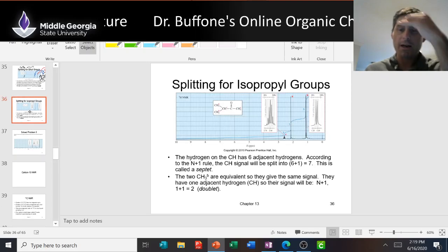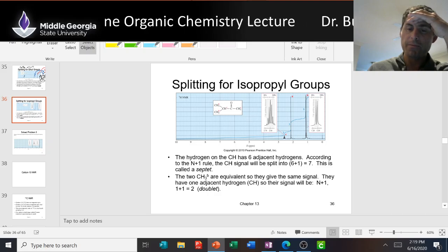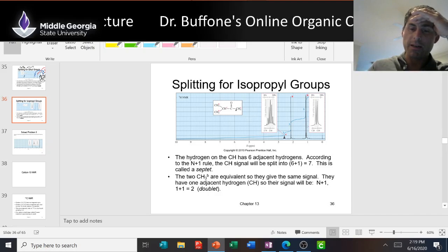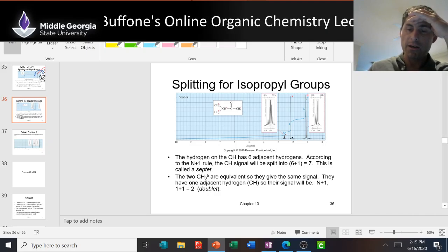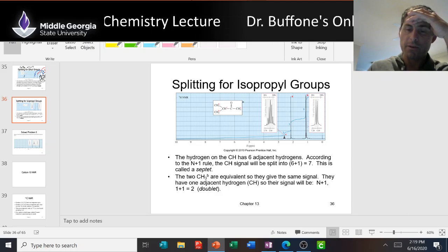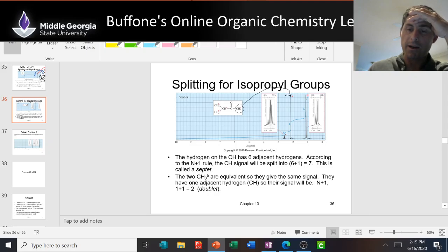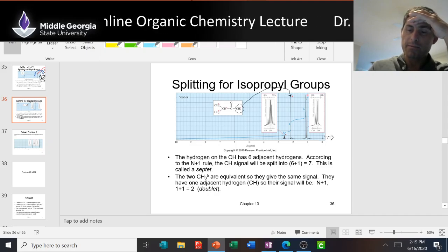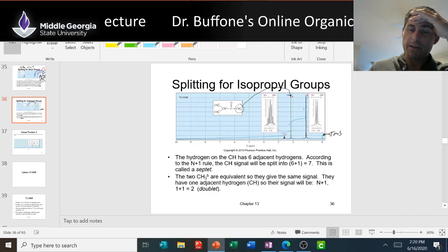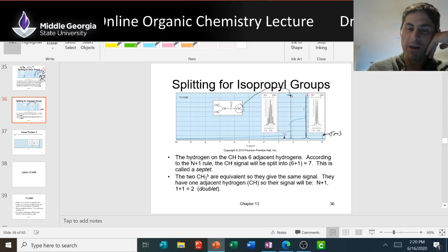Got a couple more. Check out this example. I have a methyl at 2.1 on a ketone. It's a methyl ketone, right? So I'm going to say that's going to be at about 2.1. If I look, I do have a 2.1. It integrates to 3. That's my methyl ketone. So they label this with an A. Right there you see TMS, so don't worry about that. Just ignore TMS at 0. Methyl ketone, right? 2.1. Thinking methyl ketone.